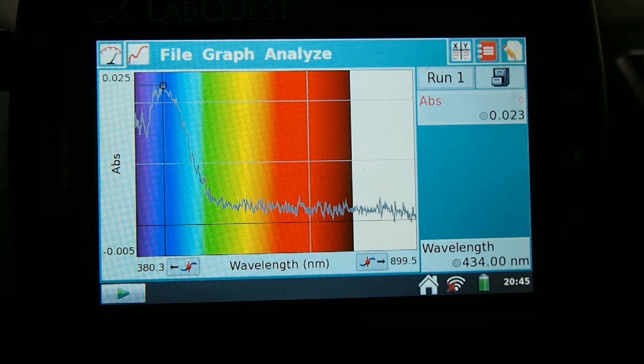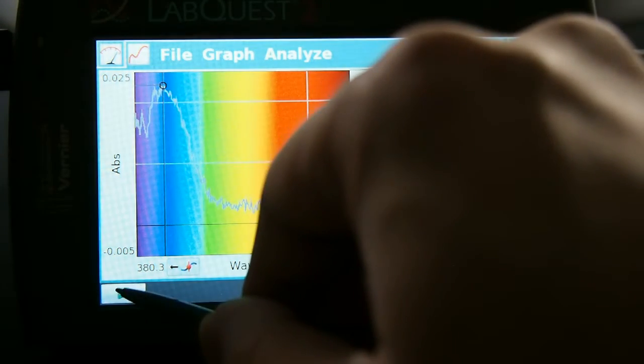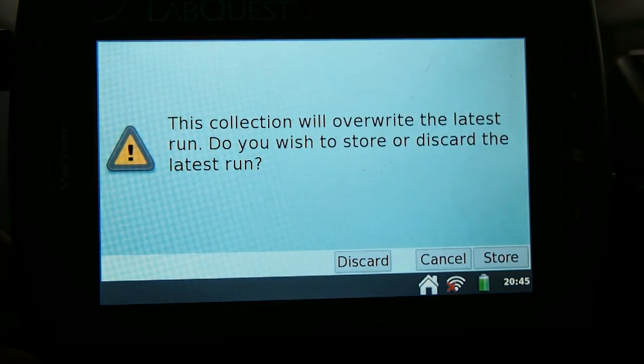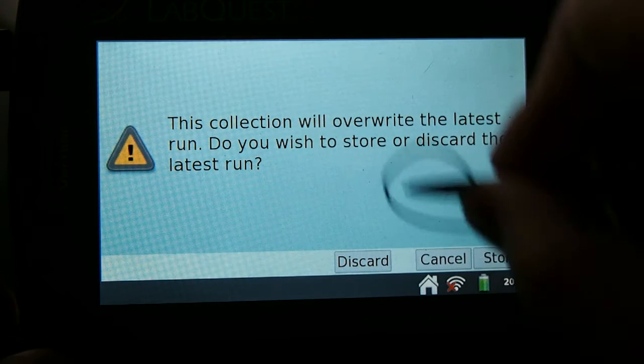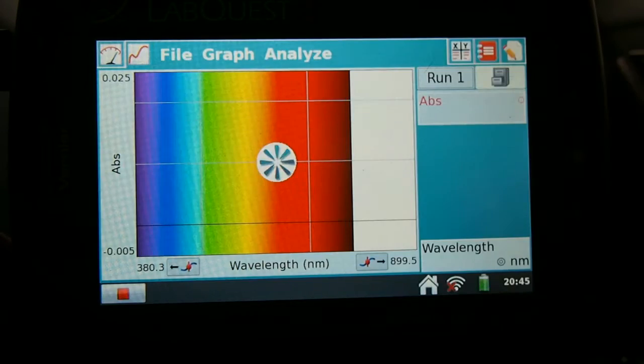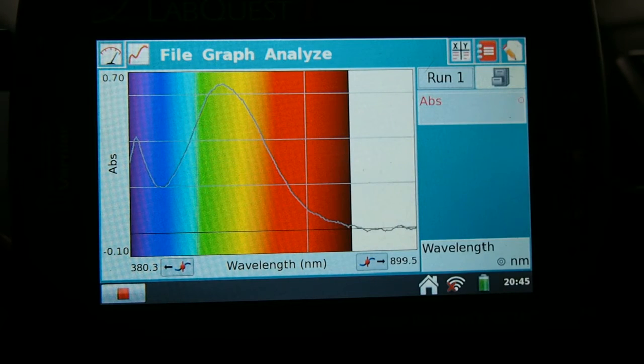Before we continue, you may wish to put a blank cuvette into the system. You will see that when you press finish calibration, you'll get this prompt. We can press the start or play button once again, and it'll ask us if we want to overwrite our data. We can put the cuvette with the highest concentration in there and continue.